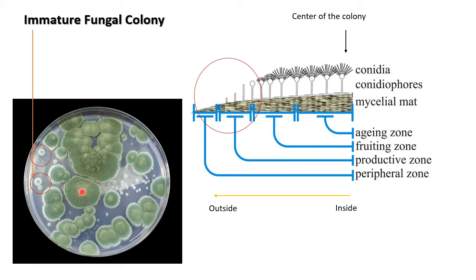And this one is a mature colony. You can see the whole colony has a green color from the conidia. You can make out the difference between the center of the colony and the peripheral zone. You will also get to observe the difference in mature conidia. This is how you differentiate between an immature fungal colony and a mature fungal colony.